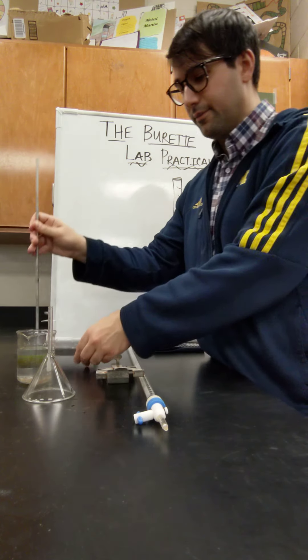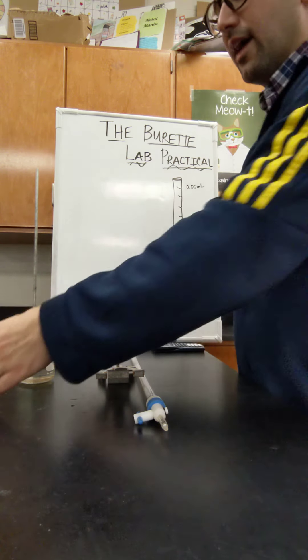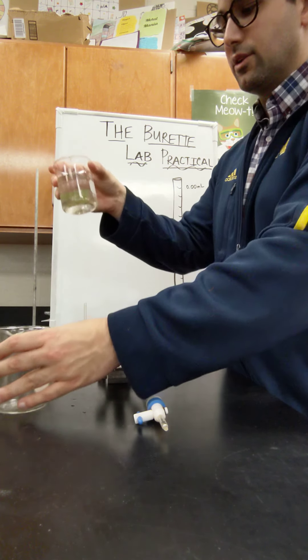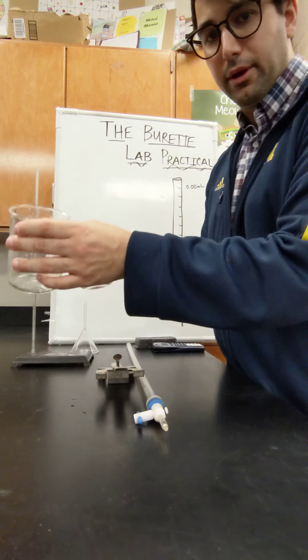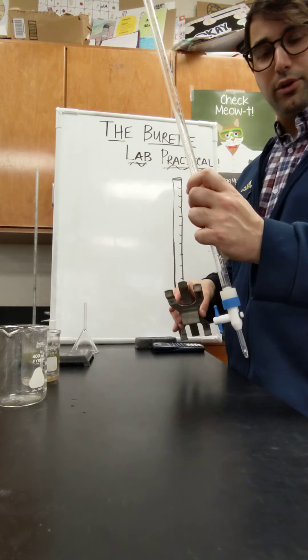You're going to need a ring stand, a long stem glass funnel, a big beaker and a small beaker. It doesn't matter how much you put in there — just a small beaker of water and then a bigger beaker. And then a burette clamp and your burette.